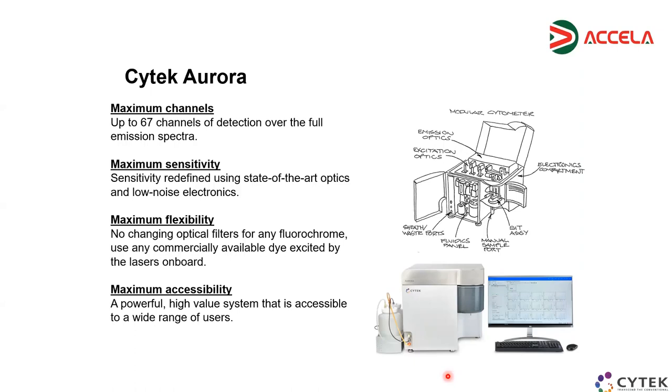Yeah, okay. But my question was about the automatic 96 well plate reading. I have like five rows with one kind of dye, and I don't want contamination between the other, let's say eight rows of it. So to actually add a cleaning row between them, as I understand. Yes, you can do this.